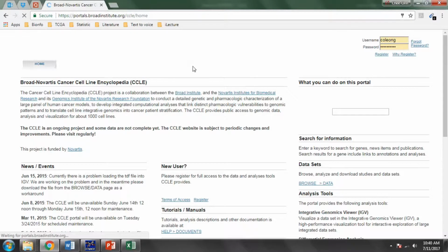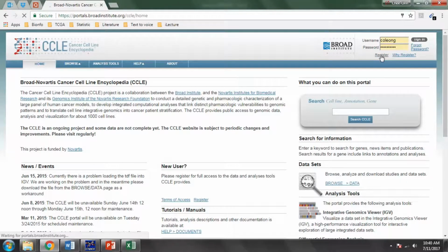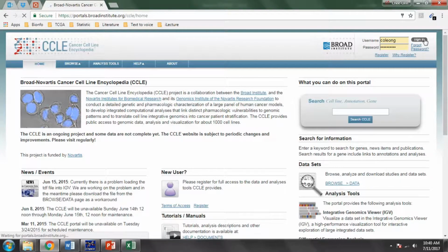That will land you on the CCLE homepage at the Broad Institute. So you need to sign in in order to download the dataset.